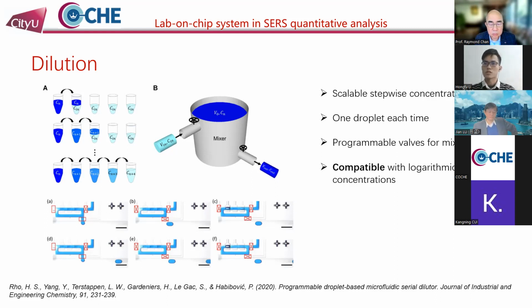The diffusion process of the sample can be accelerated in this way. And the dilution ratio is highly related with the expanding time of the valves at the inlet. And the scholars have already proven the validation for generating logarithmic concentration.